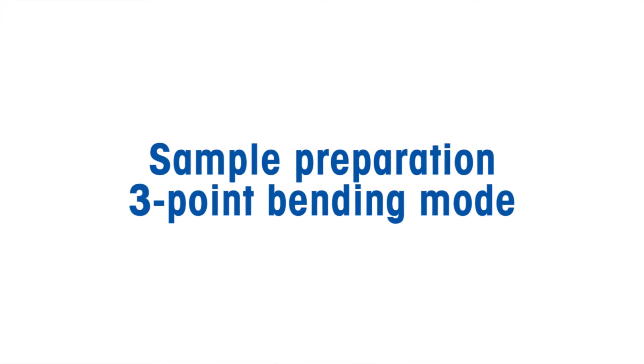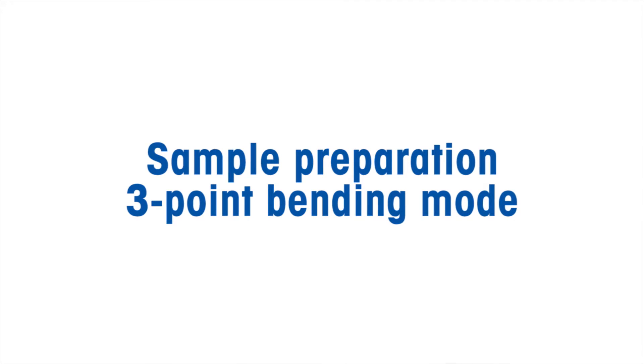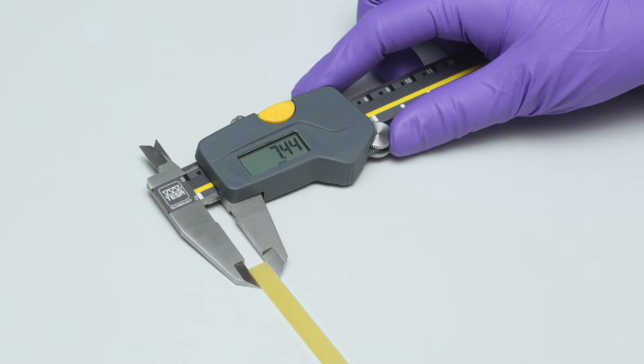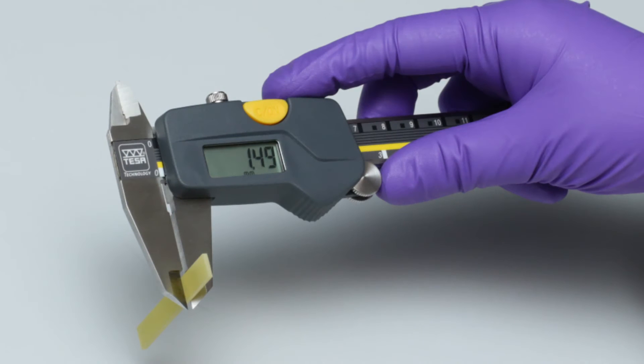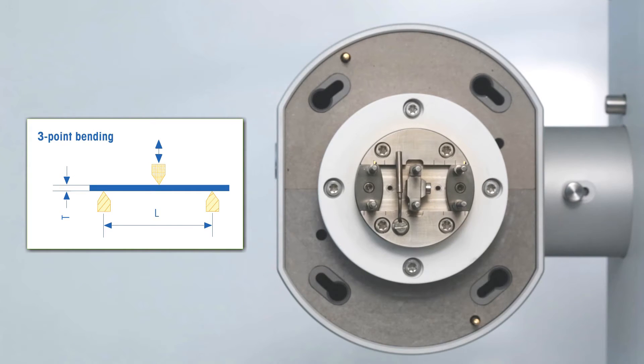Let's start with the sample preparation for 3-point bending mode. First, we can measure the PCB sample's width and thickness with a vernier caliper. The sample length is given by the distance of the outer clamps.